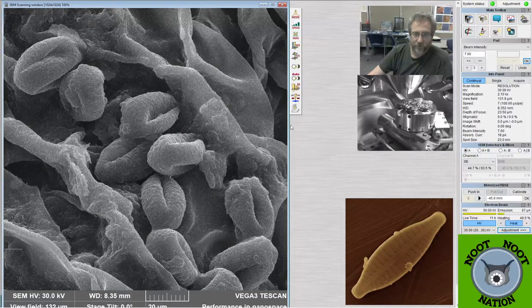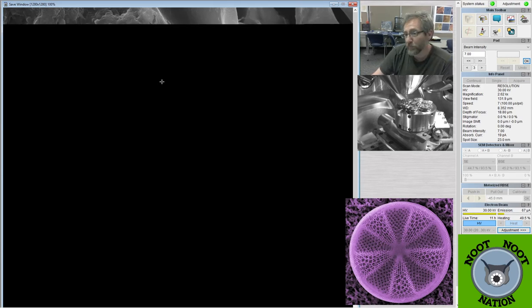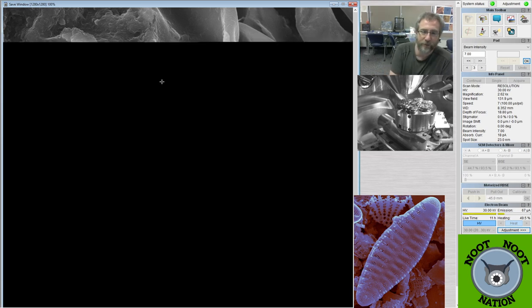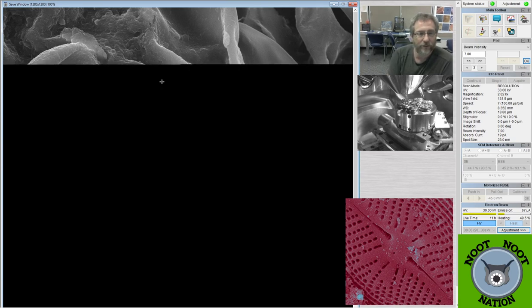Very nice. So primarily I use the SEM to look at diatoms, but today we're looking at pollen, just for fun, for the most part. I like to put some other things on the SEM to give people a broader experience from it, and do a little science awareness stuff. I don't know when we'll get back to looking at diatoms, probably next week. I might do some more pollen, I don't know.